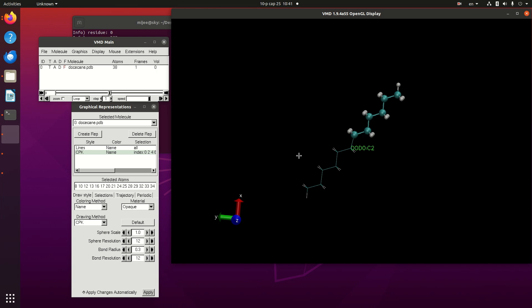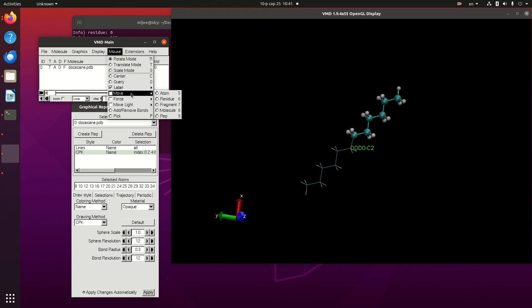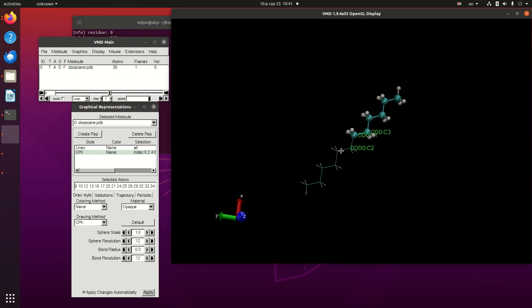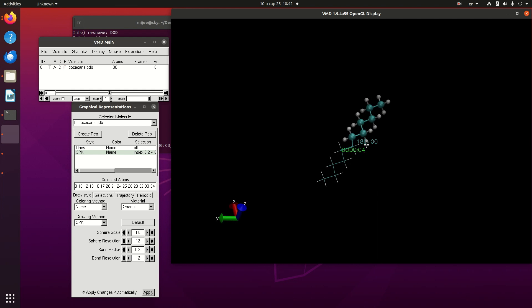Okay, now I want to measure the dihedral angle. Okay, next one, second one, third one. This dihedral angle value is 180 and I would like to change to 120.